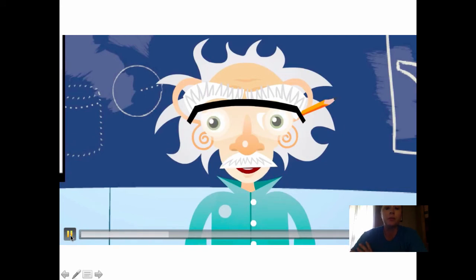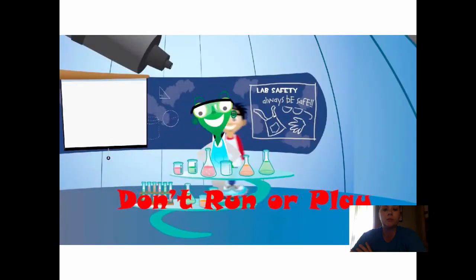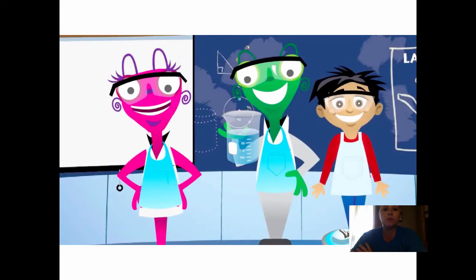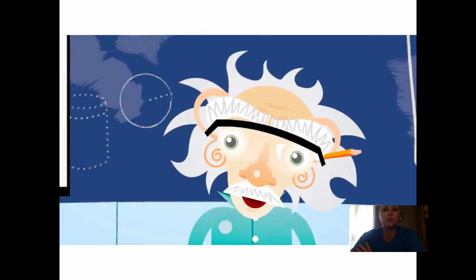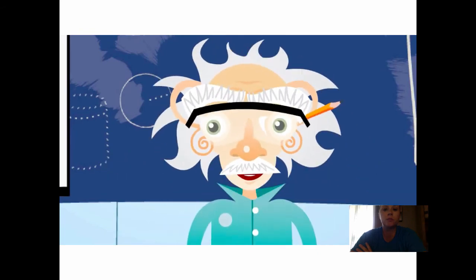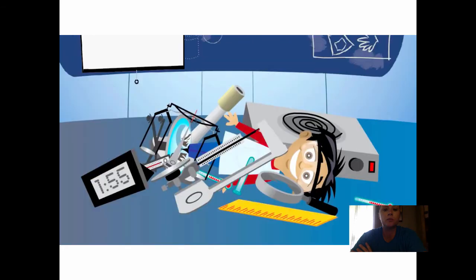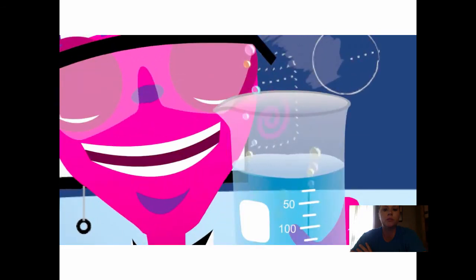Morals of that story, always wear safety goggles. And if I do say so myself, they're quite attractive. Running and playing in the lab is something you should not do. And don't drink or eat anything when you don't have a clue. Without a doubt, it will look very interesting, but it could be very dangerous. Please be careful. Notify your teacher if there's an accident or spill, and never smell a chemical directly.